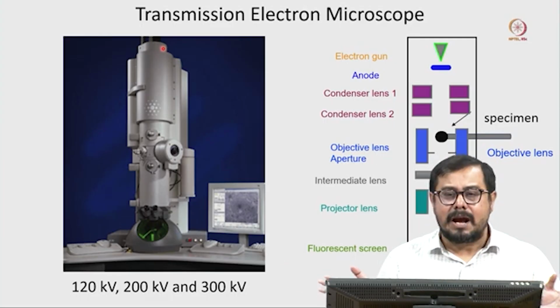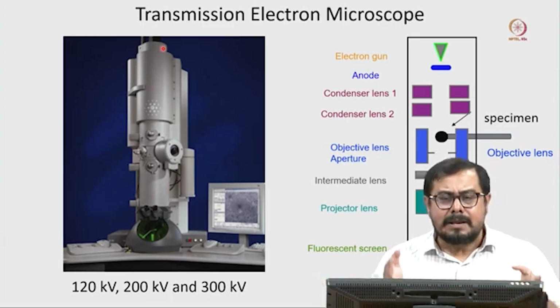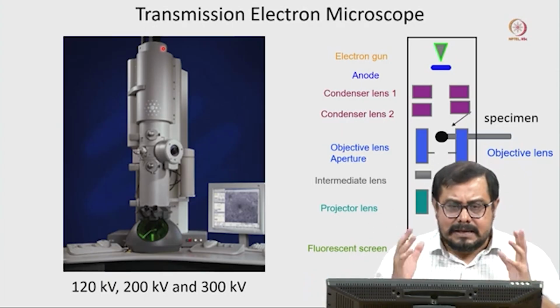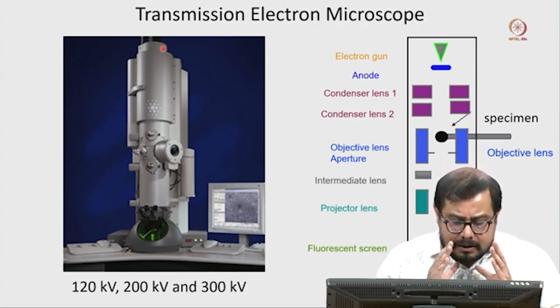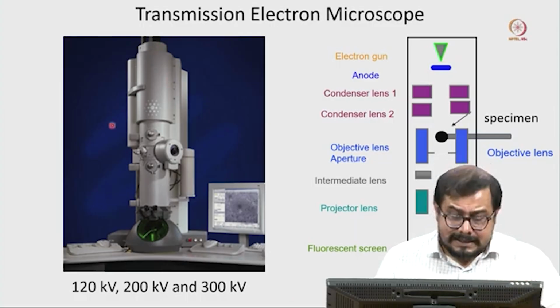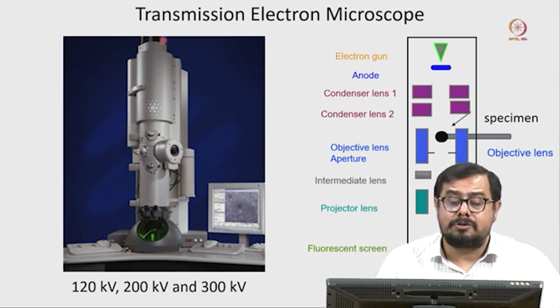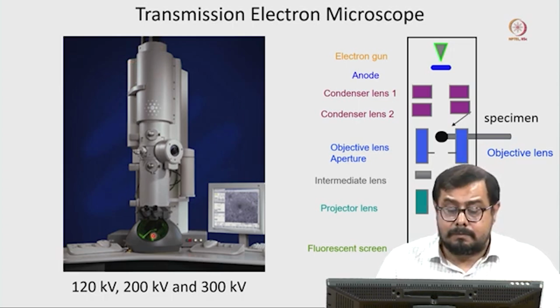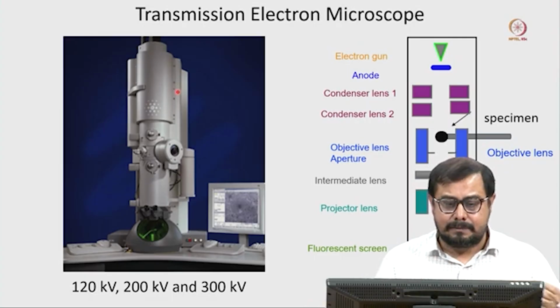It will interact with other molecules or atoms or air and it will deflect, and you will get only noise. It cannot generate a good amount of electrons and scattered electron beam to give us a good image. That is the reason we cannot see the electromagnetic lens or gun or other parts, because it is entirely under a high vacuum. Not only that, even our filaments are very delicate and very expensive.